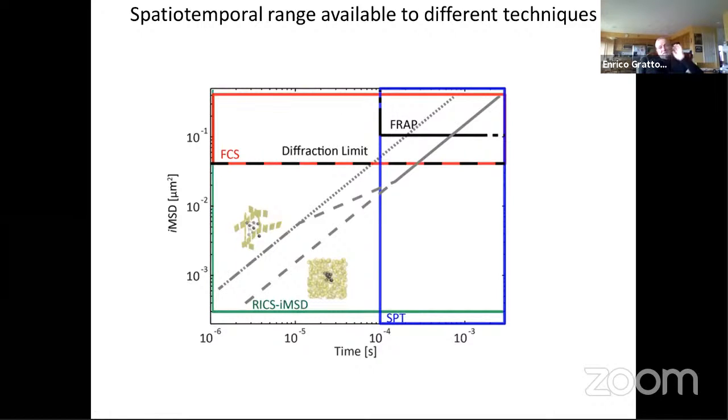So I will stop here for this presentation. I wanted to show this data because I think it complements very well the discussion that we had when I gave my lecture, about where that is coming from. There is nothing magic. Simply, it's the structure of the cytoplasm, which is different from the structure of the nucleoplasm, which is more similar to a polymer with cavities. Okay, so I will stop here and answer your questions, and then go to the next application.